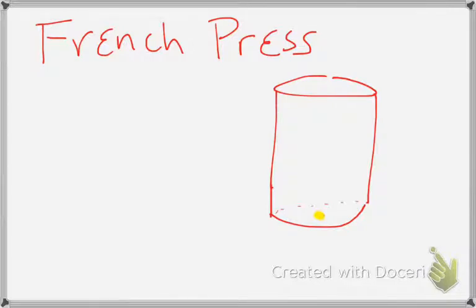All right. And so what happens is you literally pour your solution into that container. And then there's a receptacle underneath that's going to collect it. And then the piston comes down. That's why it's called the press. And it presses it down and it forces everything to that little tiny hole. And by doing that through brute force, it causes the bacteria to literally squish each other open.